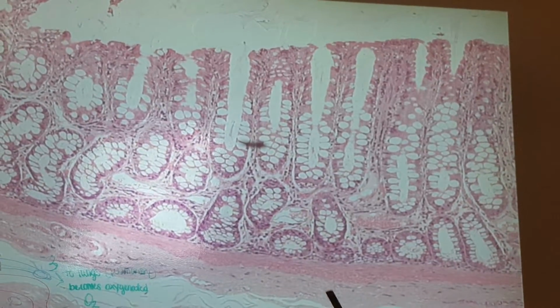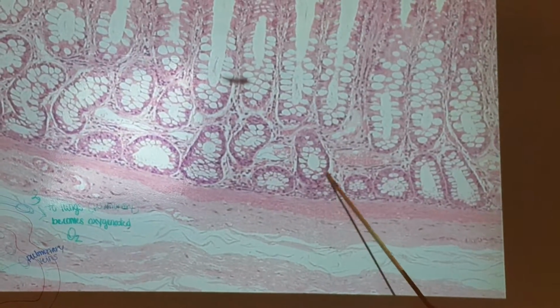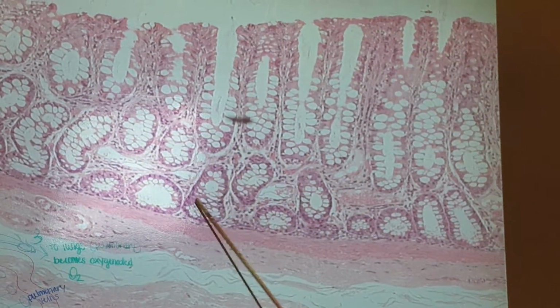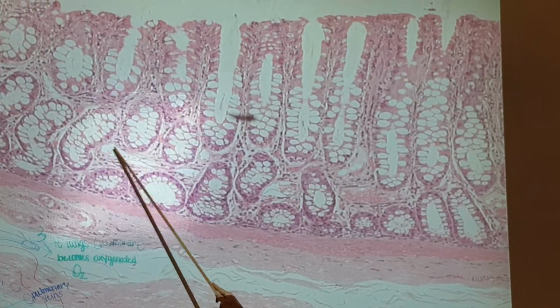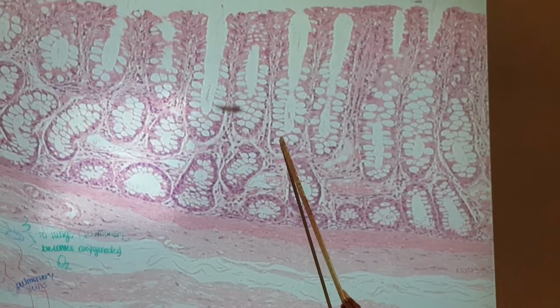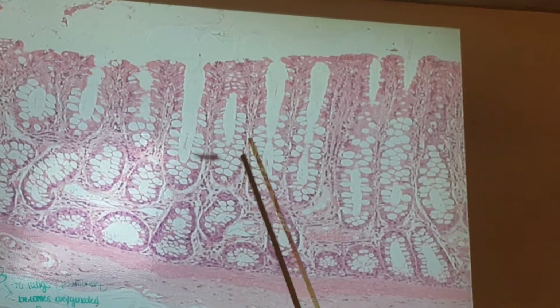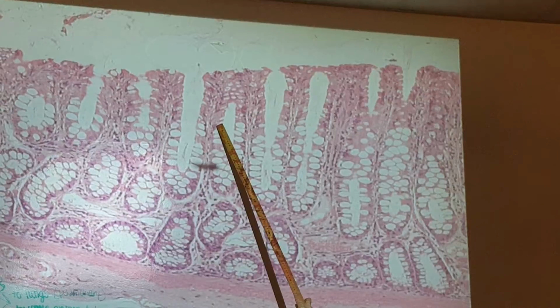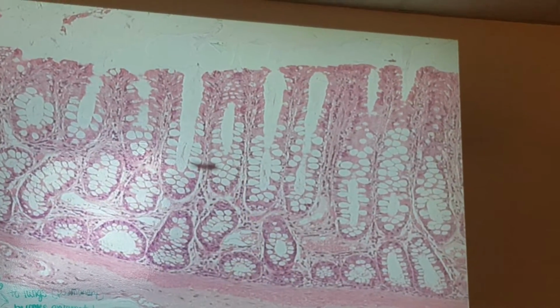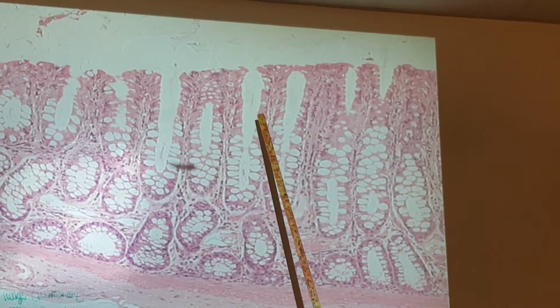So our muscularis mucosa layer right here, so mucosa begins there. These whole things are the intestinal glands. All the background here, lamina propria. All these little circles, goblet cells. And we have a place without the circles right here. What would these be? Simple columnar. Simple columnar.